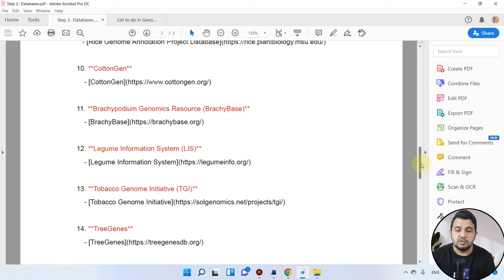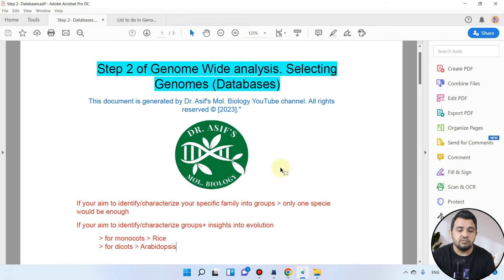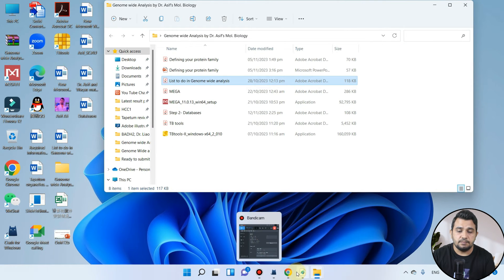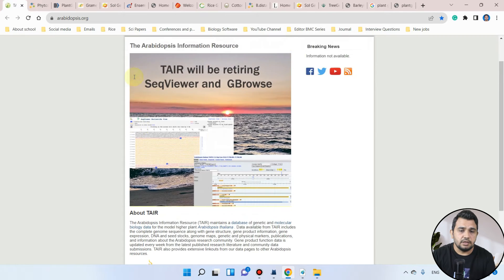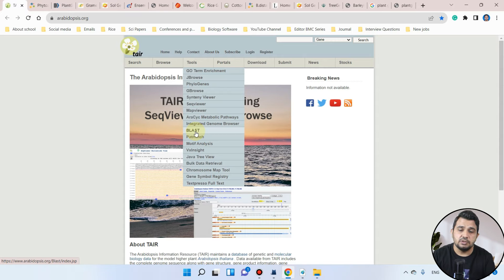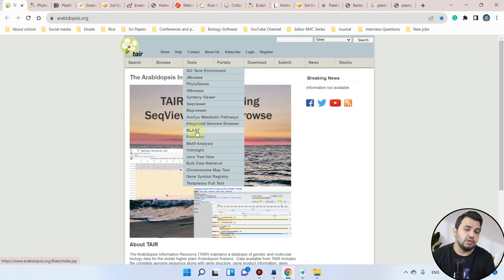Let me show you one by one which tools we will be using to get the protein sequences. The first one is the Arabidopsis Genome Information Resource. We will mostly be using the Tools tab, which has different options. Among them, we will mostly be using the BLAST function. I will also make another video providing hands-on training for how to use the BLAST function of plant genome databases.